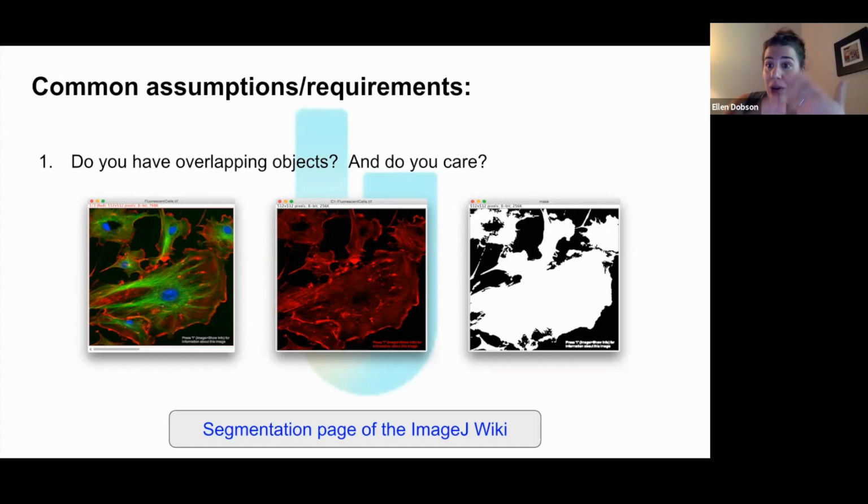If there is significant overlap between two cells, a given pixel can therefore belong to more than one object. And at that point, you basically can't have individual objects. You can't say, okay, this pixel belongs to this one, not this one. You really have no idea.